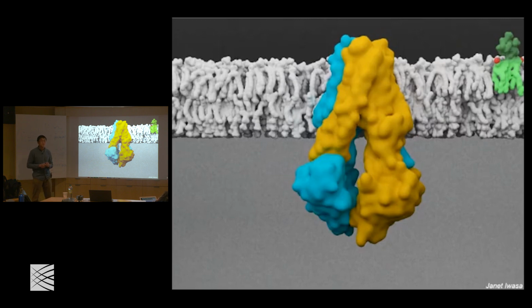Did you try to solve a structure without LPS? That's a very good question. It's actually very hard to get a protein without LPS bound in it, because when we purify, most of them are stably bound with LPS. We are trying a couple of approaches to strip off the LPS and see what conformation it is in without LPS inside. It's produced in E. coli? Yes, mainly.